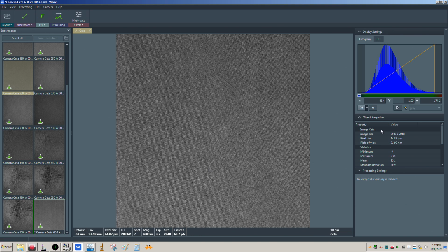So now in principle, if I multiply the exposure time by 10, I should up this by 10, and that should give me a comparable image to what I was maybe getting at spot size 4. The question then is, if you're going to do that, you might as well just use spot size 4 and take it for 1 second, because ultimately your dose is the same. You only want to do this if you gain something. But you can see the cost here in terms of the signal to noise is pretty staggering, okay?